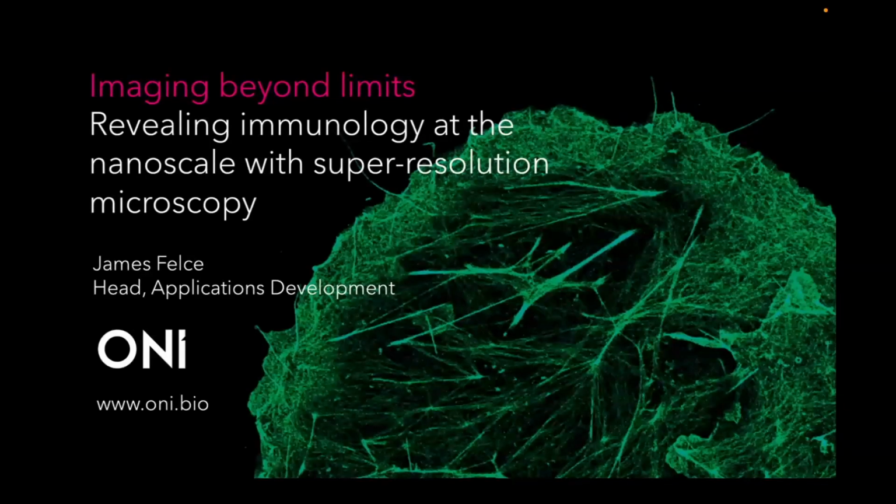And the aim of this webinar today is really to explain why super resolution can be informative in immunology. It's not so much a demonstration of ONI technology, although I will be talking about that towards the end. It's more a case of where within the biology of immunology are nanoscale events important? Why would someone want to interrogate them? And how have people done that in the past? And how might people do that in the future?